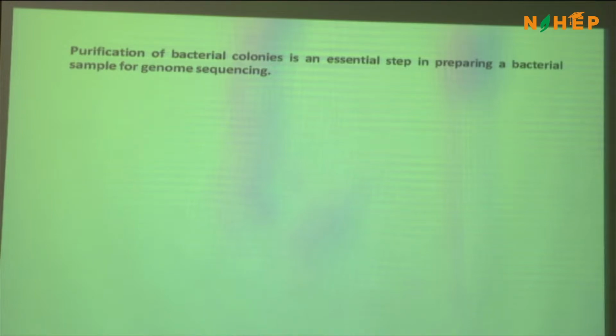But if two different pseudomonads are coexisting on the same plate, that raises lots of doubts, right? So to circumvent those confusions, only in our lab we have developed a very elegant technique. Can we decorate the bacterial colonies by adding some supplements in the medium? In one of the papers we published in Environmental Microbiome, I do not know how many of you noticed, the petri plate had colonies looking blood red in color, some of the colonies. It's no magic there. We have added some chemical, 2,3,5-triphenyl tetrazolium chloride, in the medium.